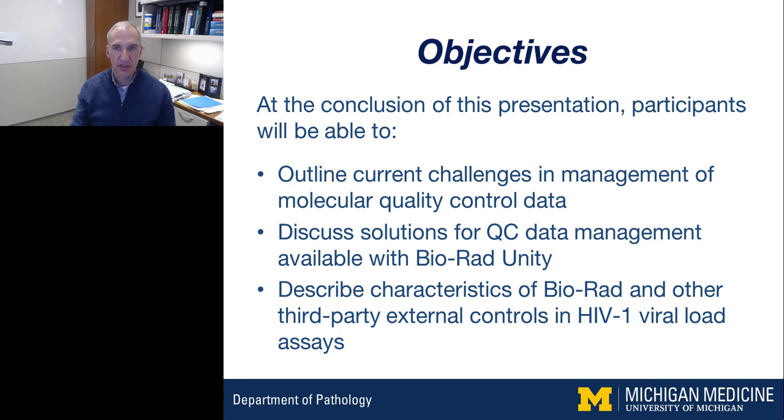So for the presentation today, what I would like to do is show you some examples from my lab of how we manage this data and some of the challenges. I'll also review some approaches that can be taken with Unity, the product from Bio-Rad. I'll also finally share some results of a small evaluation we performed with different commercially available external controls and how Unity was used to monitor that data, but also how the controls perform relative to each other.